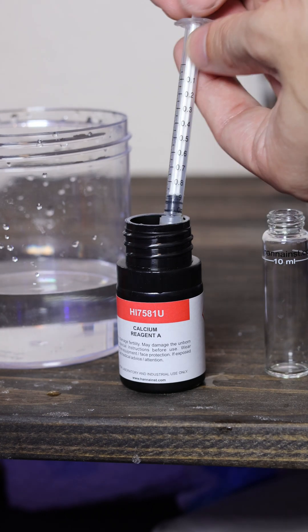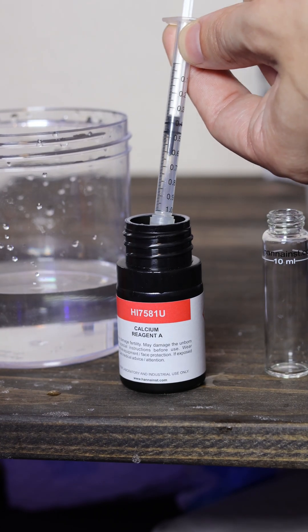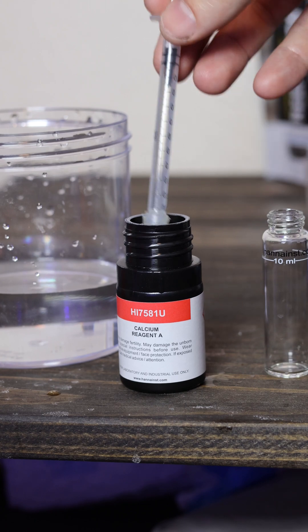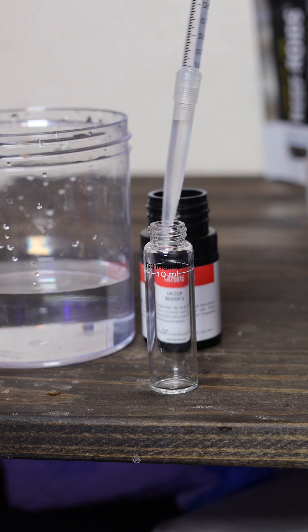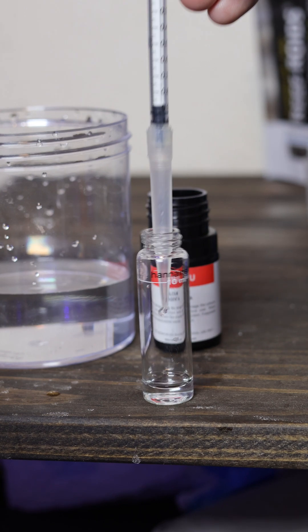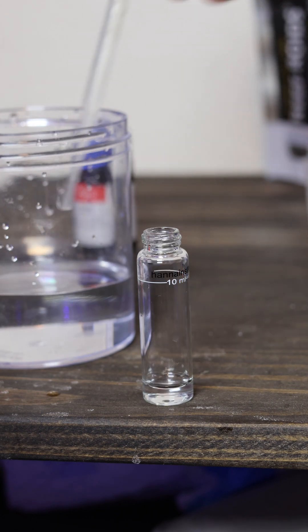We're going to start by taking one milliliter of reagent A. Use the nozzle that comes with the test kit and pull the plunger up to where it says one milliliter. You're going to notice that there's no reagent inside of the syringe. That's perfectly fine. Put that reagent A into the test tube and then we're going to use the RODI water to fill up the test tube the rest of the way to the 10 milliliter mark.